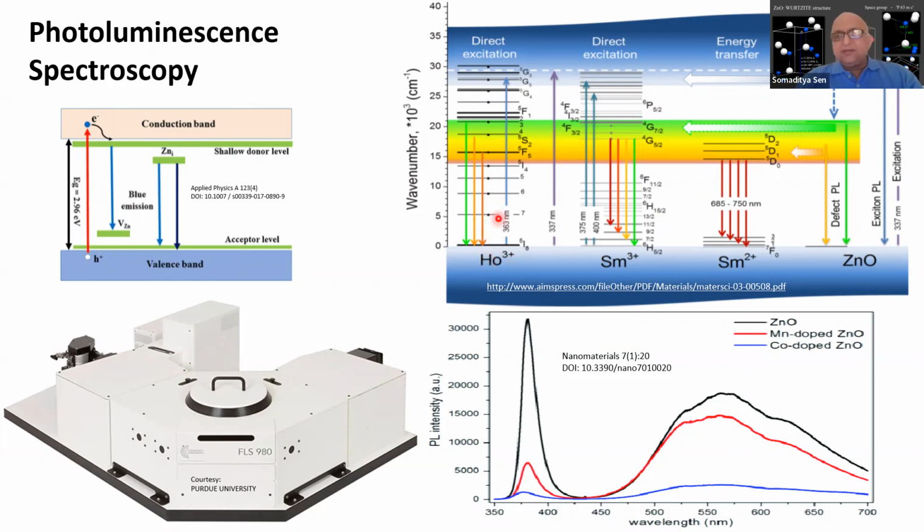And some of these energy states are falling inside the band gap of zinc oxide. Okay, so these will contribute to different types of colors. Okay? Apart from that, there can be higher order colors, beyond the band gap, there can be other sources of excitation. Even luminescence. Okay.